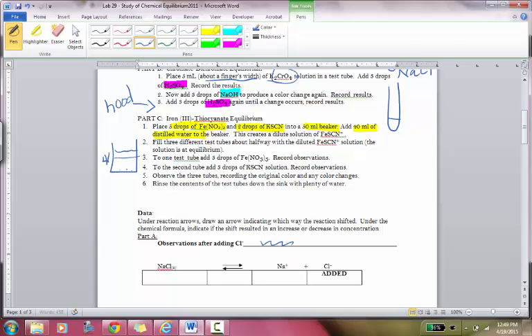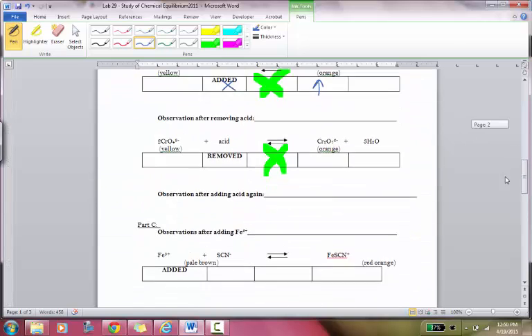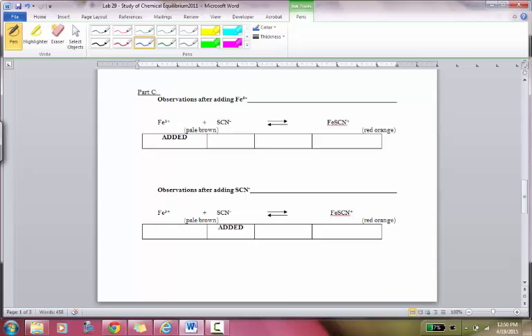It does not have to be exact. Remember, this is not a quantitative lab, it's a qualitative lab. So that will be precise enough for our work today. Go ahead and do the remainder of the procedure in Part C asks, adding to 3 different test tubes the required solutions. Again, record your observations down below here in Part C. Add the iron, what happens? Add the thiocyanate, what happens? And then see what you can do with this table. We will certainly talk about it together in class.